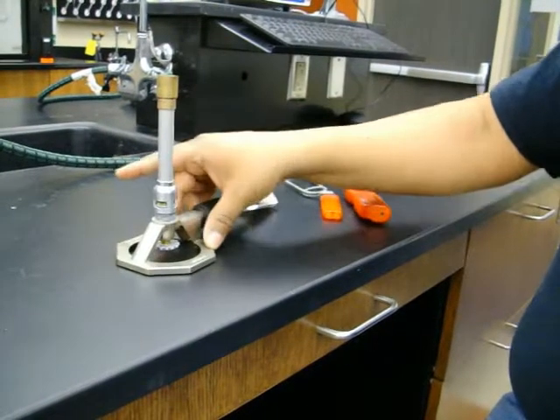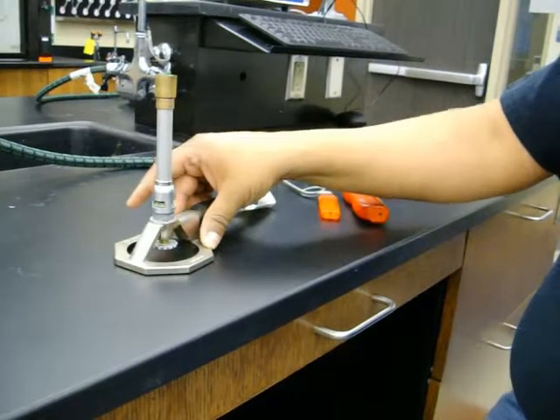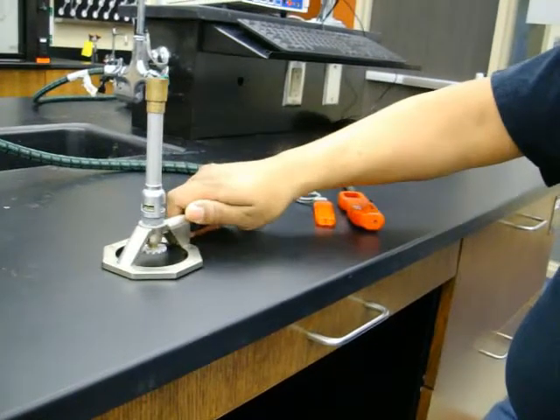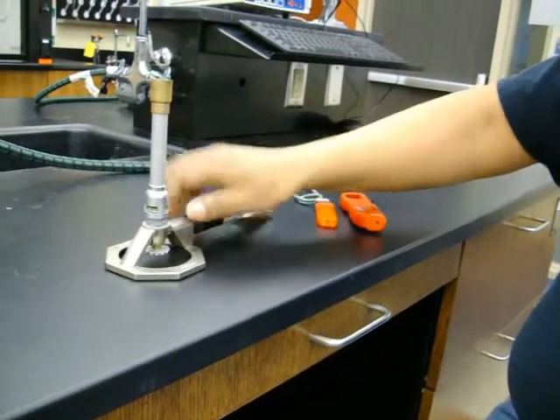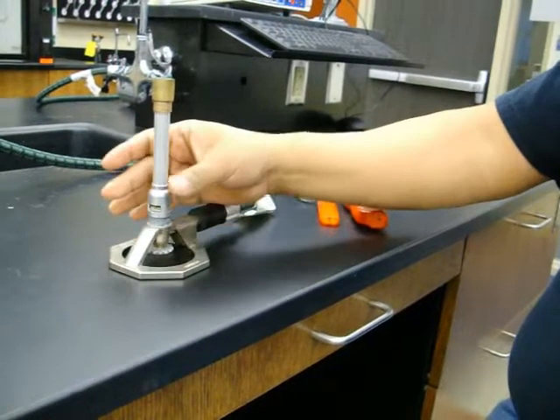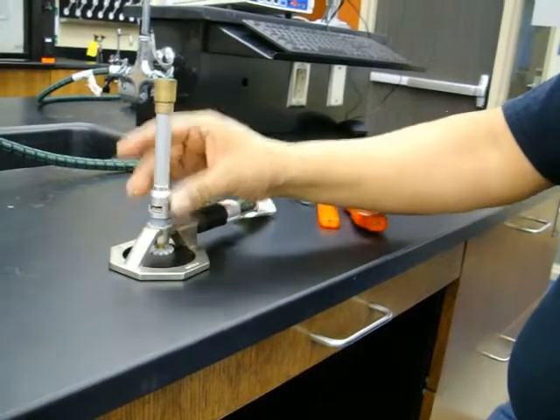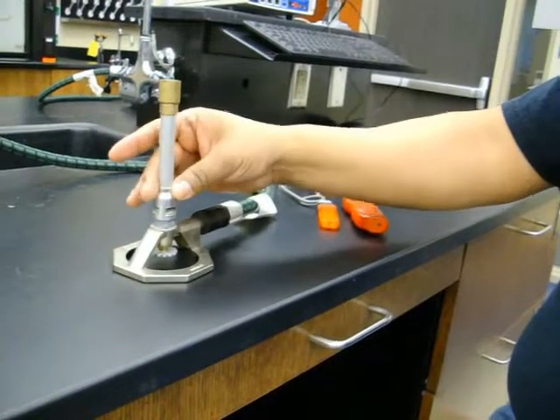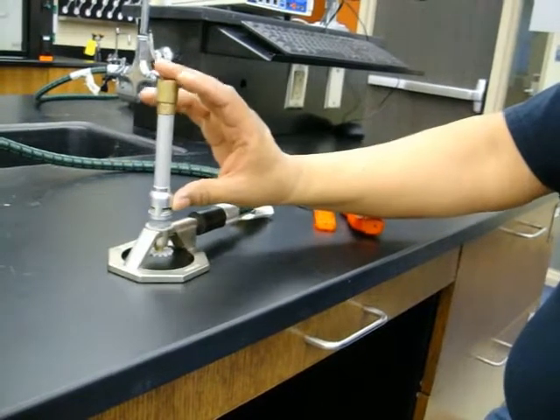A base or stand that prevents the burner from toppling, gas intake where the hose is attached, gas valve that regulates the flow of the gas, a collar that contains the air hole, air holes that regulate the amount of oxygen intake, and a barrel approximately 5 inches long.